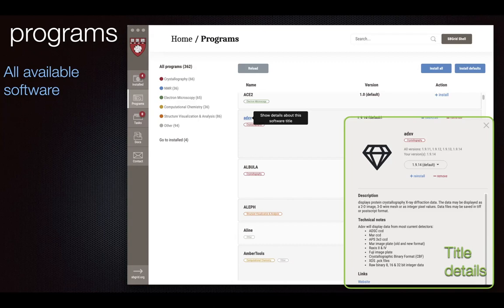They will be added to the task manager for install, reinstall, removal, whatever operation you want to perform can be done from there. But you can also do it in the pane that's behind it. It's really just there because it blocks the buttons underneath, so it gives you the ability to still act on the software without having to close the window.